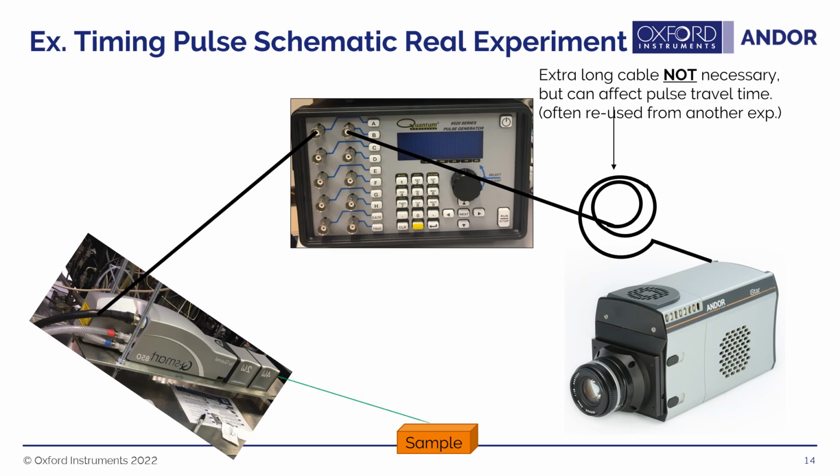You can see that the laser will fire at the sample, and it will create some laser scatter and some emission from the sample, and then subsequently this travels to the lens and the sensor and all the components of the iStar camera. The laser stops and the acquisition is finished.